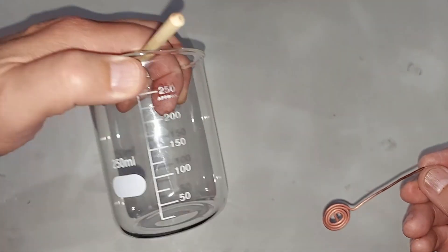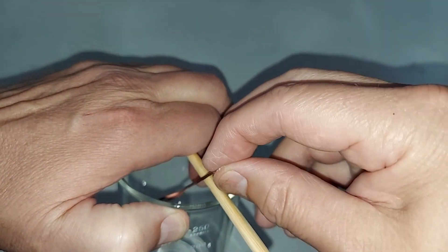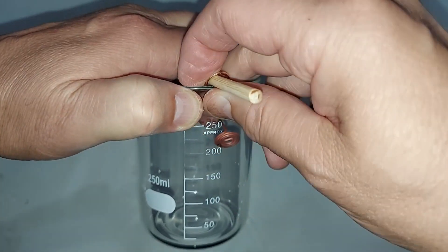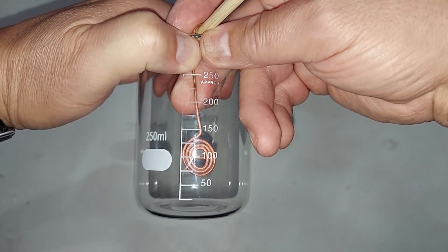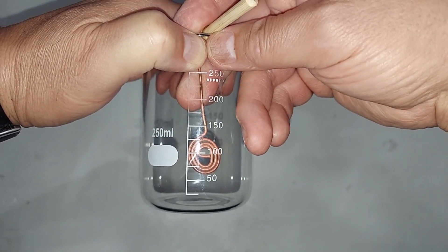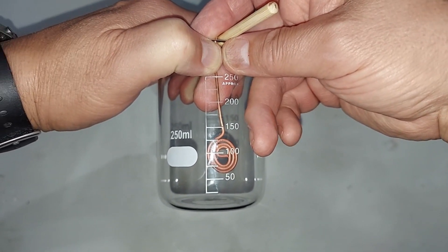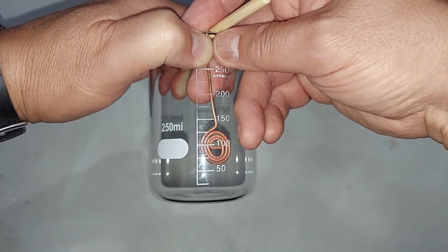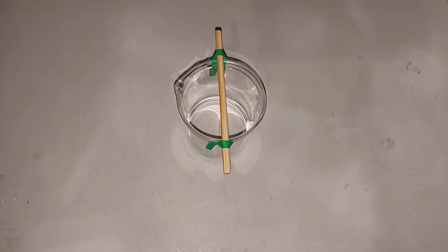Here's my 250 milliliter beaker and I want the coil to hang just above the acetone. I had pre-checked this before - I'm going to put in 25 to 50 milliliters of acetone and I know the coil will hang just above it. If it touches the acetone it is possible to light it on fire - no harm done really - but it will kind of ruin the experiment. I've placed a stick across the beaker and taped it in place so it doesn't roll about.